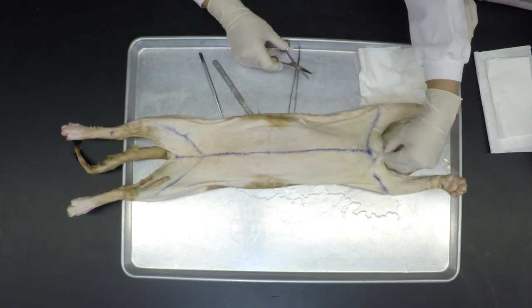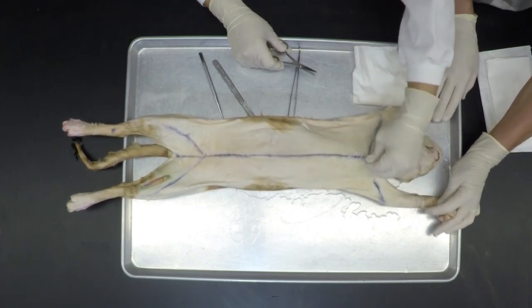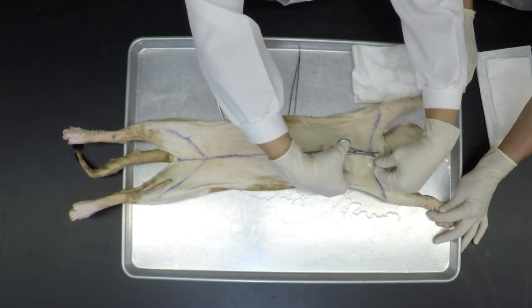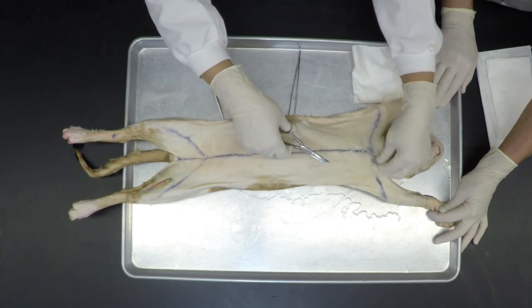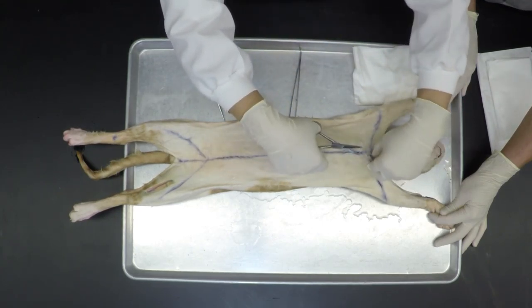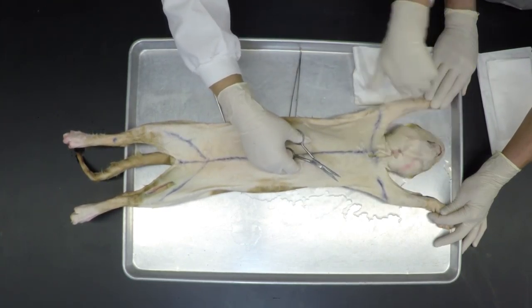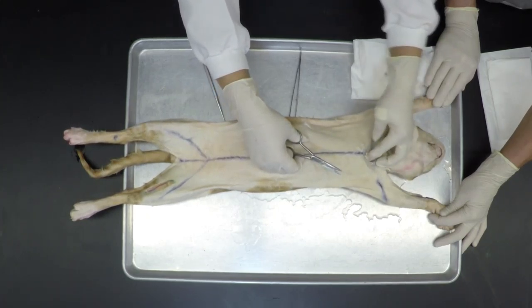To start with, we get the scissors in the middle of the neck. In this region, we separate the skin from the underlying connective tissue and make a small incision here. Be very careful with your scissors. We cut the midline of the neck. Take a finger underneath and separate the skin to make sure not to cut the muscle.